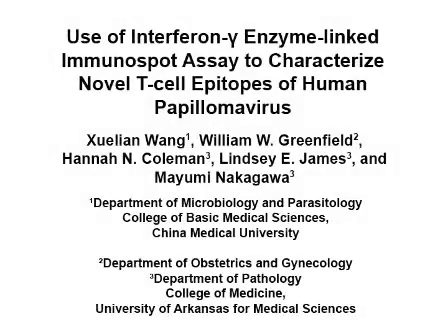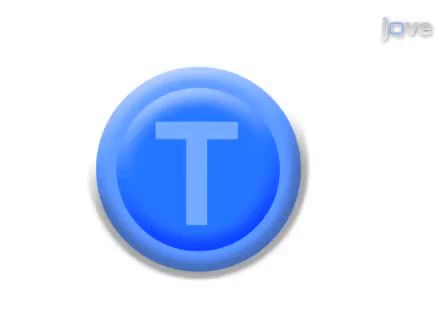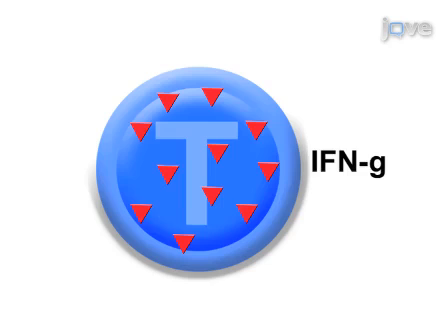The overall goal of this procedure is to isolate, grow, and analyze HPV antigen-specific T-cell clones from patients. First, establish a CD8 T-cell line, perform an Enzyme-linked assay, and estimate the frequency of antigen-specific T-cells.